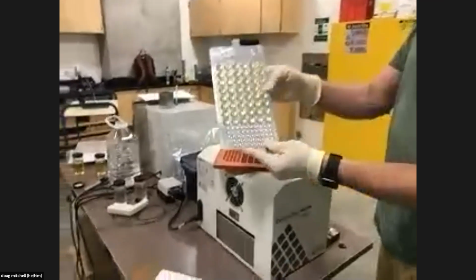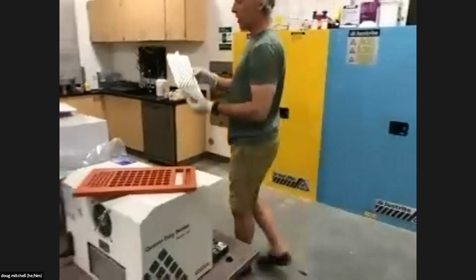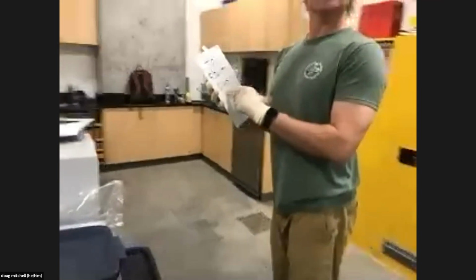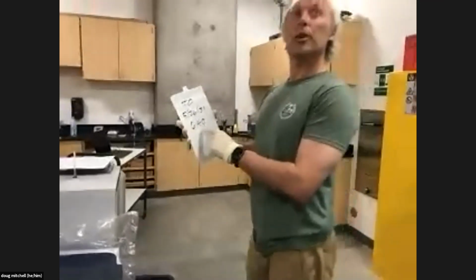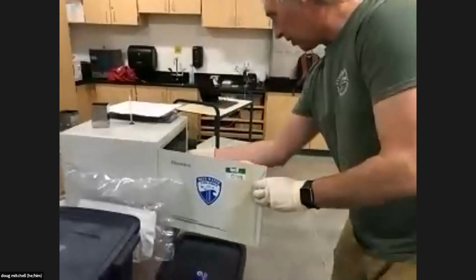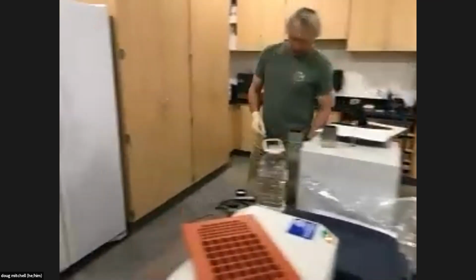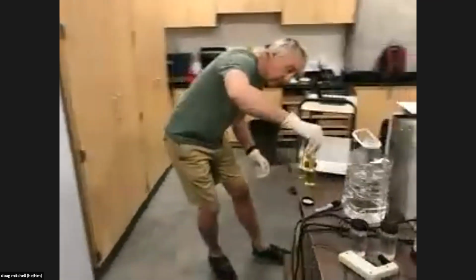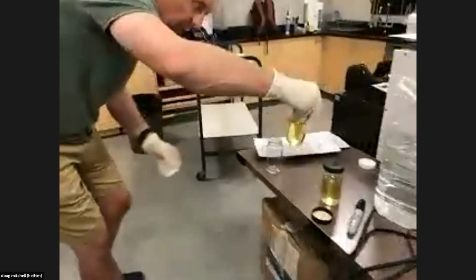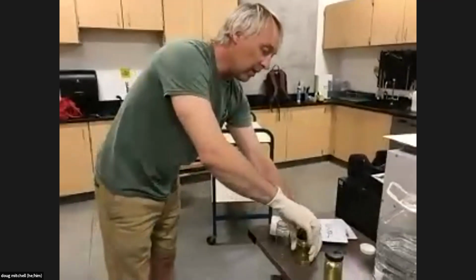The tray is all sealed up, and the sample is ready to go into the incubator once I put the time that we do it. And I put a little bit ahead of time. We're actually ahead of schedule, so I'll remember that when I take them out tomorrow. And continue with our other samples here as well, as long as they've dissolved. Well, that looks like the control has. So that one next.